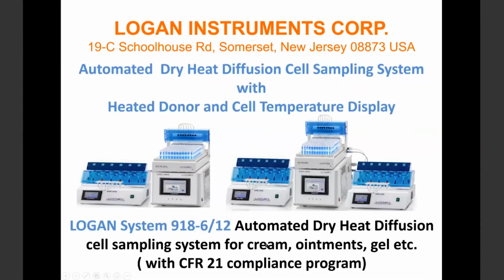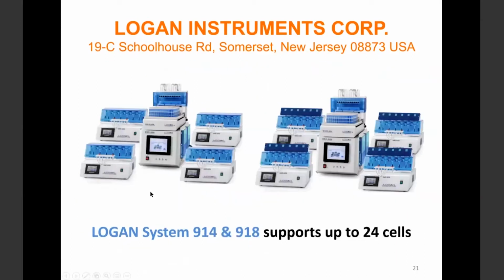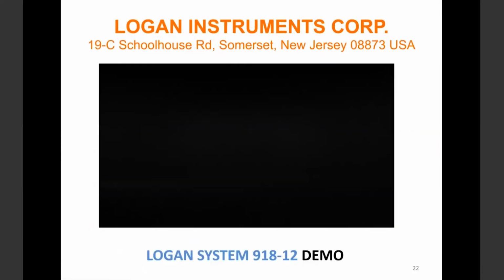So with the same system, we can have a cell temperature display, and then we have a membrane temperature display on the top. So during the test, the program will constantly print out the data: what's the surface temperature, which is the membrane temperature, and what's the cell temperature, constantly reported. Then this system, we can build out all the way to a 24-cell system. So here's the demo of the system.